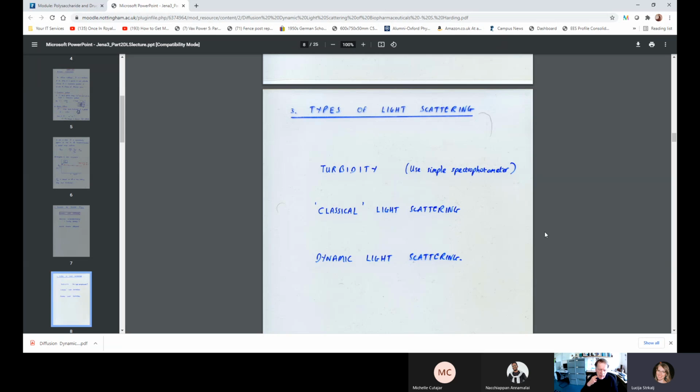Okay, but we've got that technique here in the NCMH. It's a very powerful method of getting molecular weight distributions of polysaccharides, and maybe your fiber polysaccharides and mucins as well. We were the very first lab back in 1996 to use SEC-MALS to characterize the molecular weight distribution of mucins. This was published by myself and Imo Friedrich, who's going to be teaching later on the course, and Connie Jummel, who was my postdoc many years ago. We were also the first ones to use SEC-MALS to get molecular weight distributions of polysaccharides back in 1989-1990. We were the first in Europe to have this instrumentation. Okay, that's another story. The dynamic light scattering is the focus now.